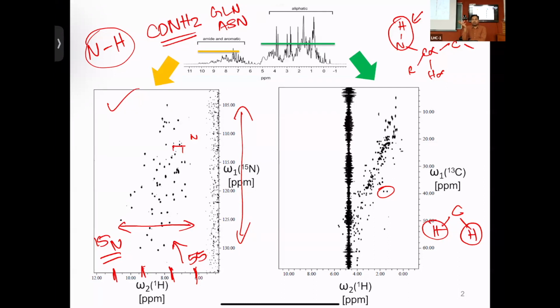And how do they get their chemical shifts? By doing multidimensional NMR, in this case, 2-dimensional NMR. Okay, we'll see how the 2D is executed tomorrow. But I want to emphasize how 2D is important, which can help you learn many different things. So let's go to the next one.